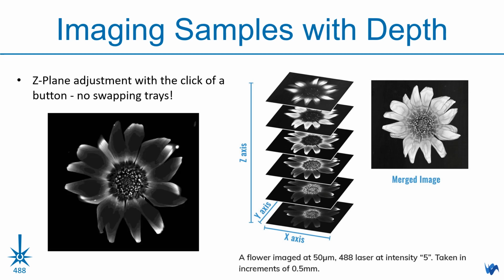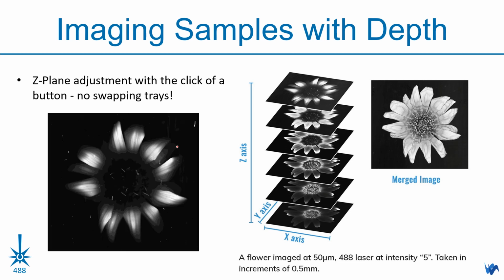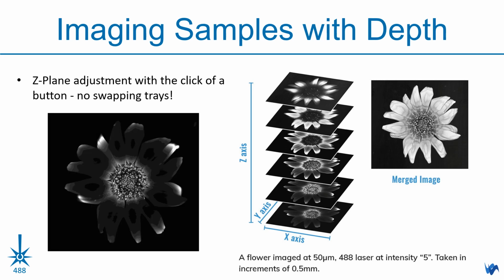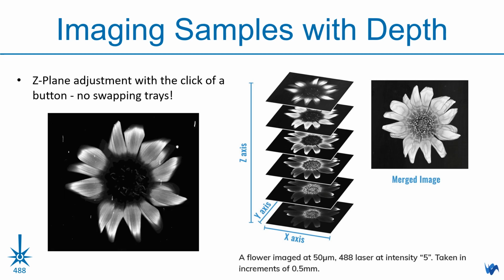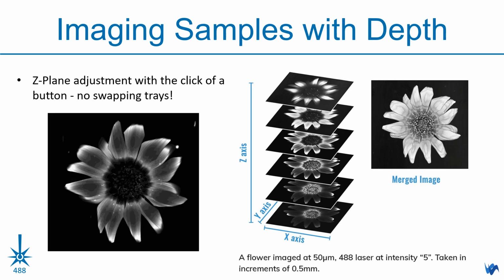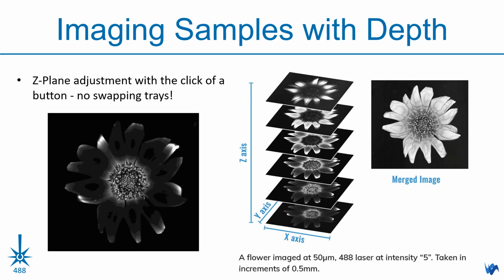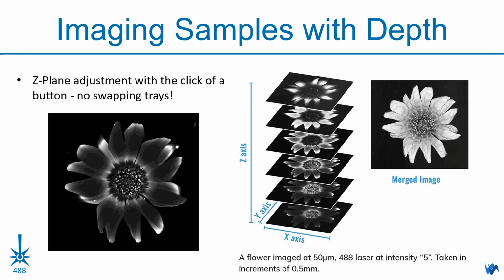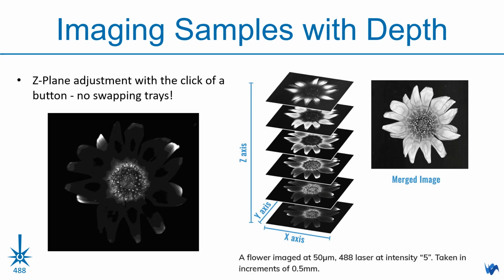When imaging complex samples with depth, it is important to optimize the focal plane. Z-stack images can be used to determine the best focal plane for your sample. The individual Z-plane images can then be overlaid in the Sapphire FL capture software to create a composite image, or used to create a GIF to show each of the layers individually in one file. We will return to our discussion about the importance of Z-plane optimization when we examine animal imaging later in the presentation. For now, we simply want to highlight the importance and ease of selecting the right focal plane for your sample type.